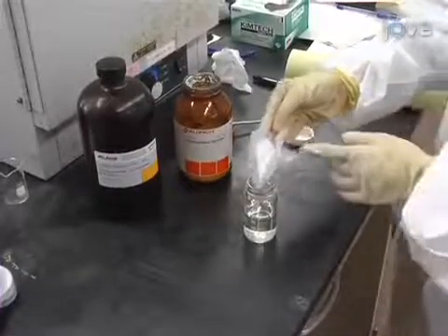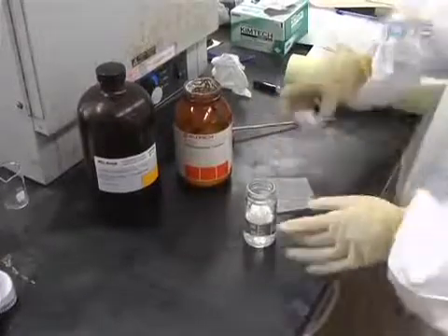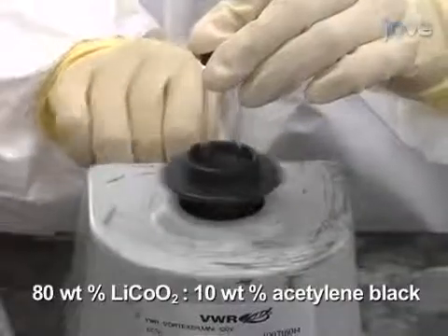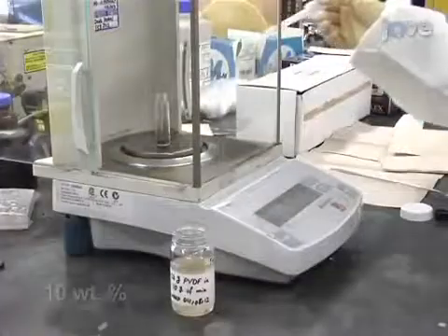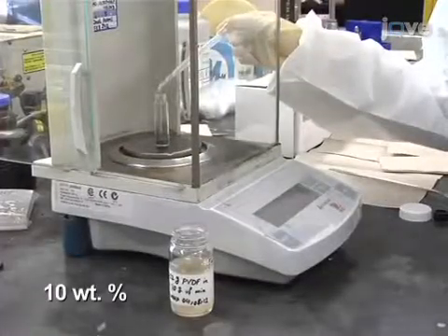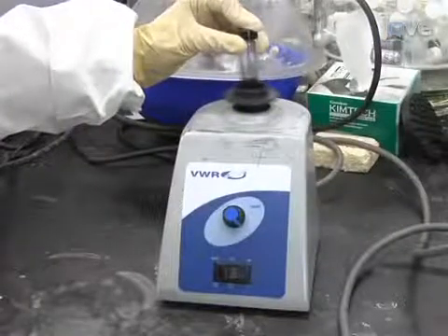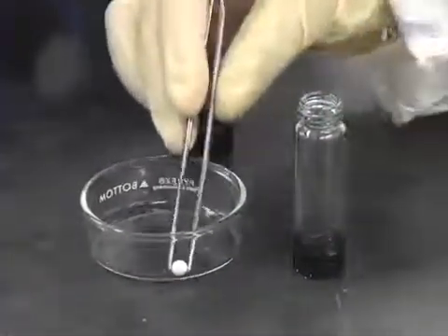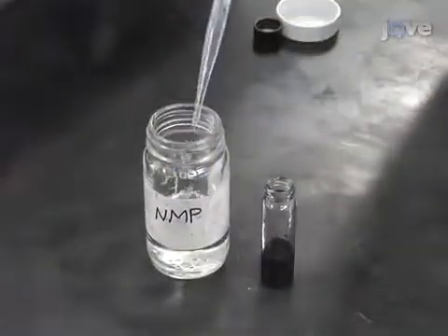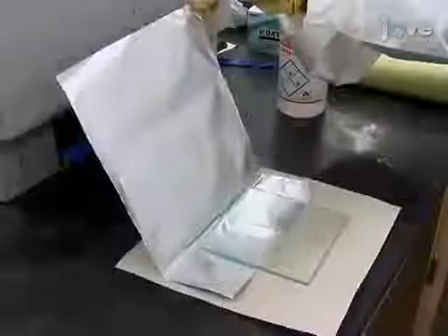First, prepare an NMP binder mixture of approximately six weight percent PVDF binder in NMP. Next, mix the active material and carbon black by vortex for one minute. After adding some NMP binder mixture, transfer the ingredients to a small glass vial. Vortex the sample at maximum RPM for about 30 minutes. If necessary, add two zirconia balls of five millimeters diameter for better mixing. Continue to add NMP as needed to obtain a slurry of required consistency.